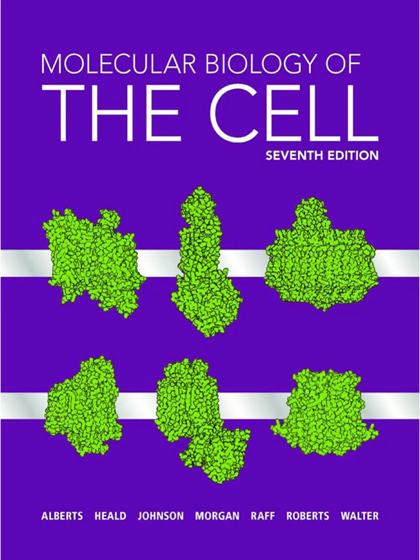And then you stick a fluorescent dye onto the antibody. Exactly. You chemically link a fluorescent dye, like fluorescein green or rhodamine red, to the antibody. Then you apply this labeled antibody to your fixed cells or tissues. It binds only where its target protein is located.